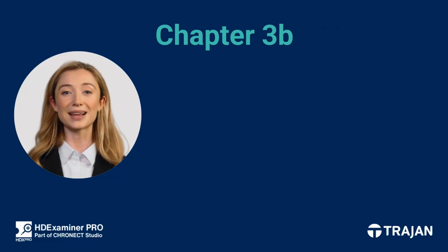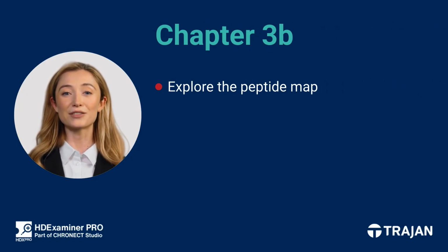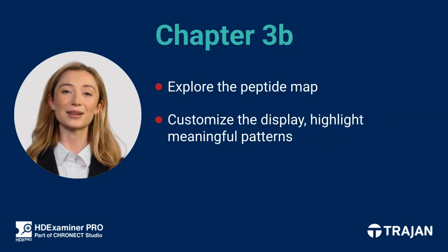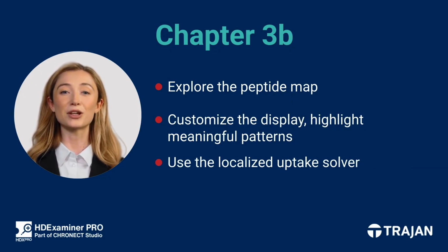Welcome to Chapter 3B. In this segment, we'll explore the peptide map, a powerful visualization tool that lets you view uptake data across your protein sequence. You'll learn how to customize the display, highlight meaningful patterns, and use the Localized Uptake Solver to dig deeper into structural insights. Let's get started.